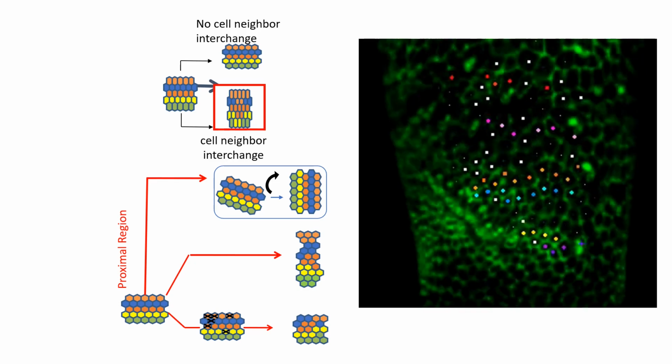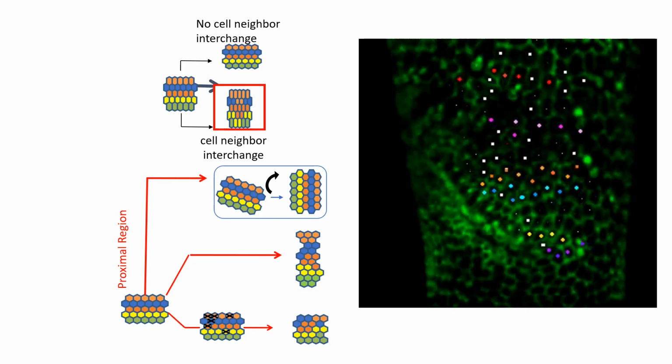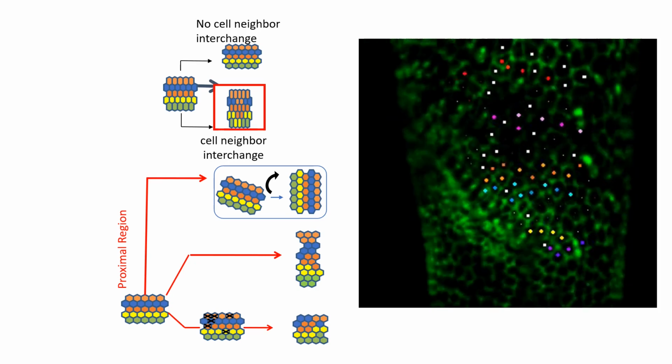And if you see, I'm going to play it several times. So for example, this purple line, they go from one line into two. If you see this yellow one, some cell seems to rotate. This one form will rotate in both directions. There's a lot of things happening.